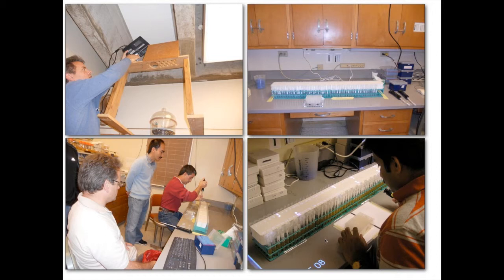An individual will sit down and take an aliquot out of one tube and pool the aliquots into seven receptacle pools that match the combinatorial that Stefano just went through. Here's the computer operator, the caller. He advances the computer and calls out something like A1 or B2, which means the position that the pipetter should see as the next available position in the source plate. And then this is the pipetter pipetting and the watcher.